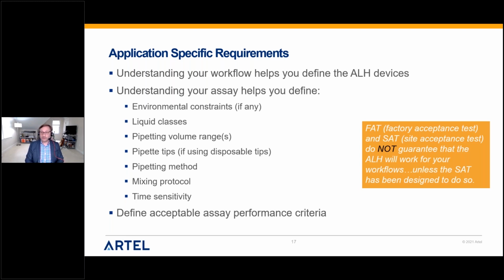And just a note here that just popped up. This factory acceptance test and site acceptance tests, they don't guarantee that the automated liquid handler is going to work for your particular workflows. The only way that it does that is if that site acceptance test has been designed to do so, and that's usually with a negotiation between you, the customer, and the vendor.